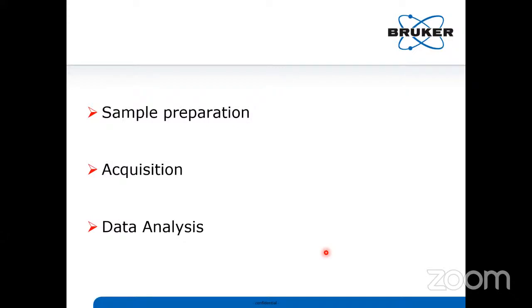Or just please note it. Every mass spec will have particular limitations and different parameters. For the same intact mass of 150 kDa, 150,000 Dalton, when you are analyzing in Orbitrap versus in QTOF, we can't expect the same temperature or the same pressure. It will completely depend upon the model and the vendor. So you should know exactly what kind of parameters you have to keep for intact mass level, subunit mass level, or PMF mass level. Nothing but 150 kDa range, 50 kDa range, or 2000, 5000 mass range.